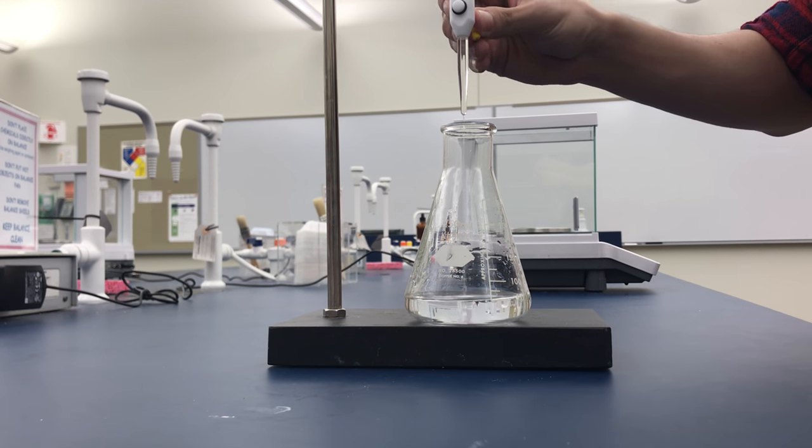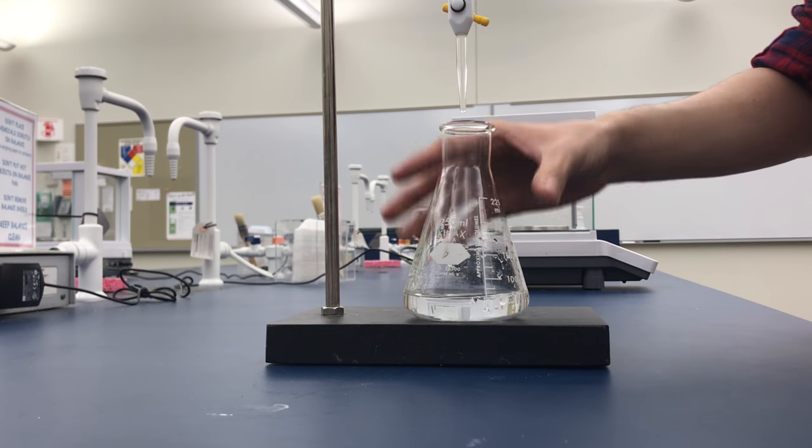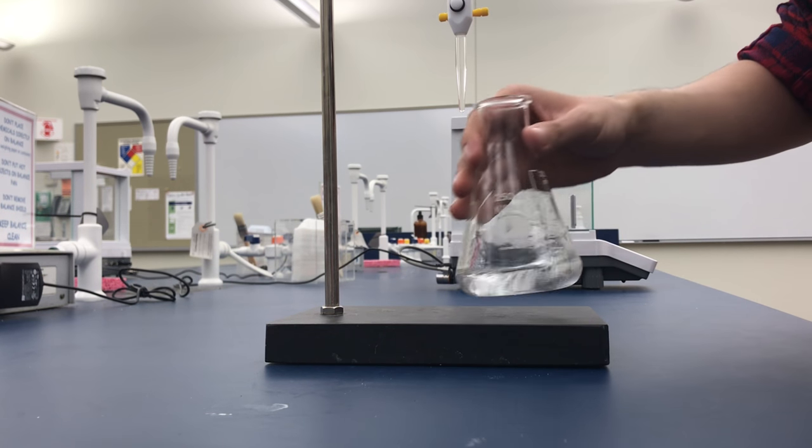The burette dispenses the known solution into a flask of the unknown solution containing the indicator. As the known is added to the unknown, the solution will change color then go back to being colorless.